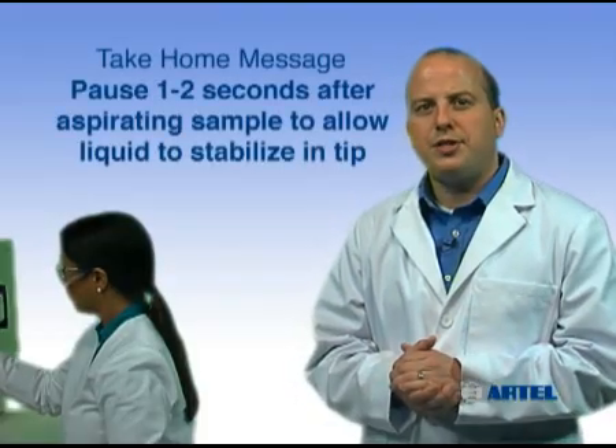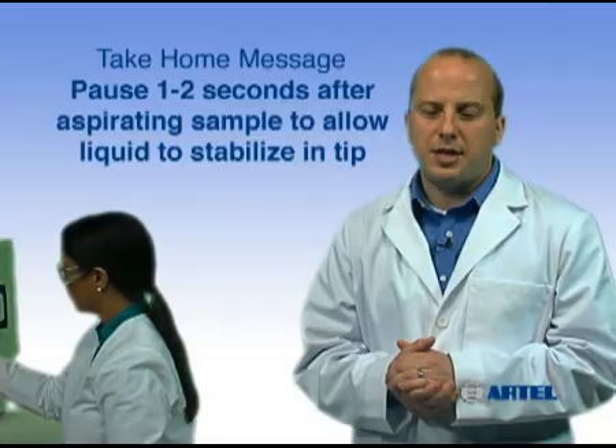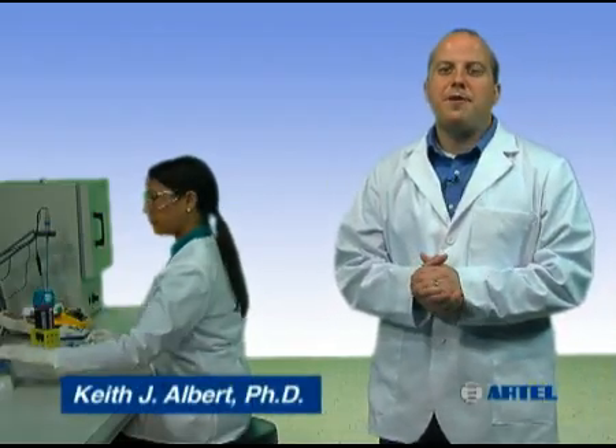The take-home message is: slow, even plunger release and a consistent one-to-two-second pause after aspiration will allow the liquid to stabilize inside the tip. Help ensure liquid handling quality in your lab by using proper pipetting technique.